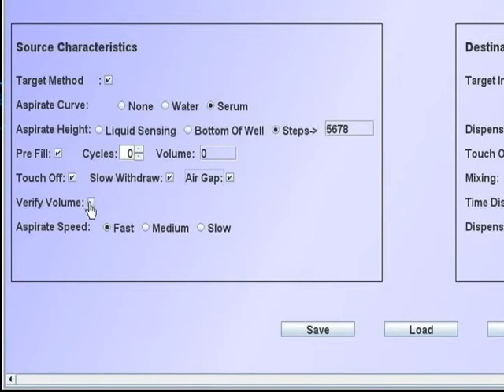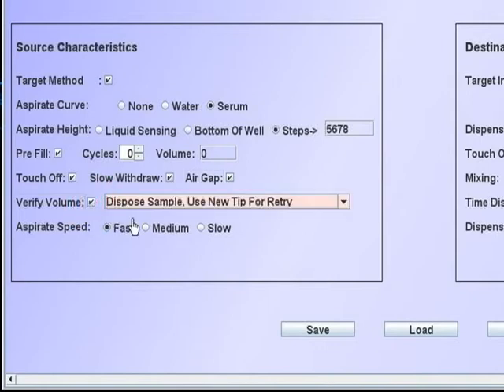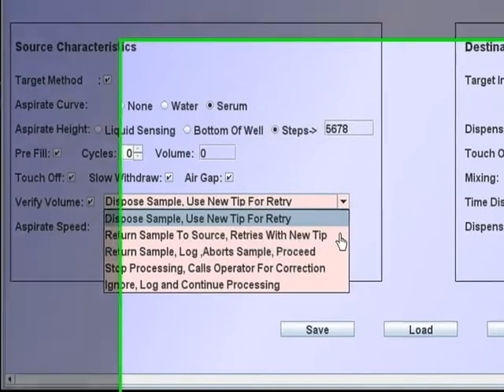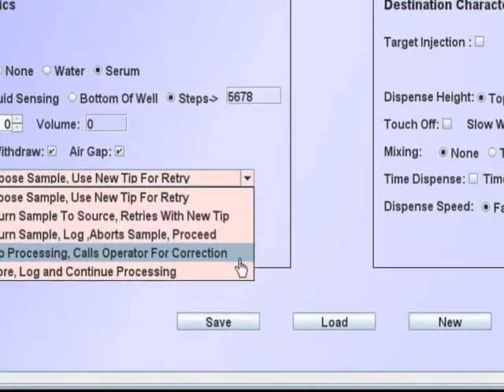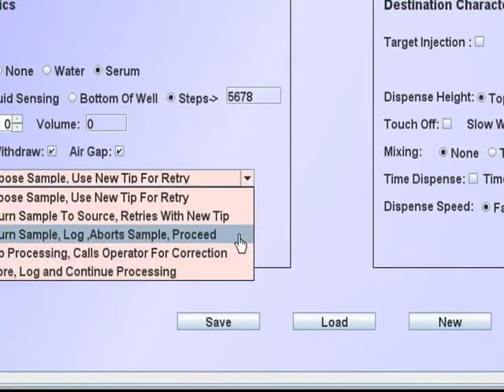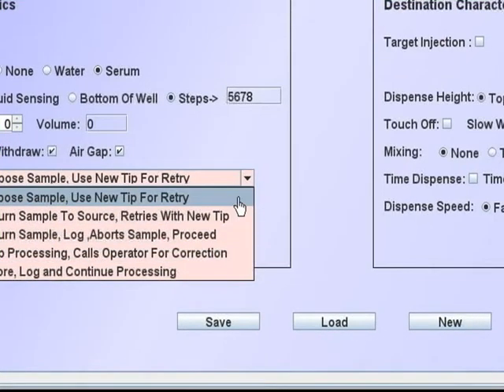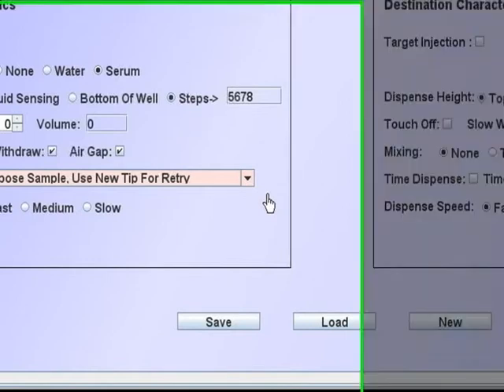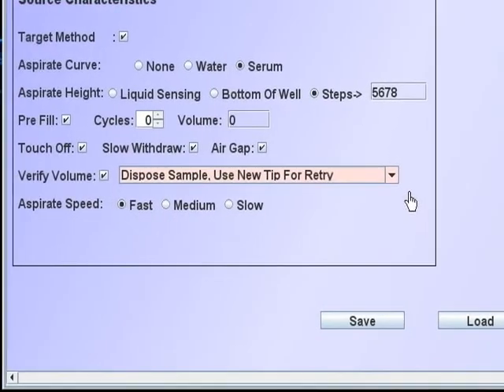If verified volume is checked, it will cause the tip to move to the meniscus detector for a volume verification. If the verification fails, the error recovery for a retry will be as selected.